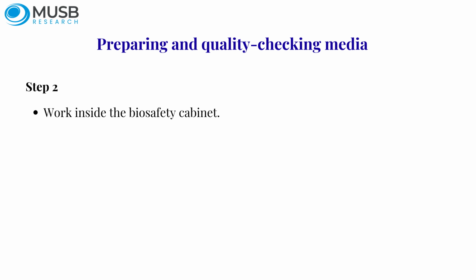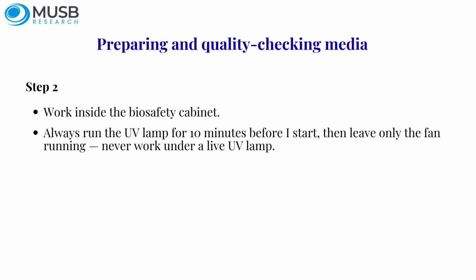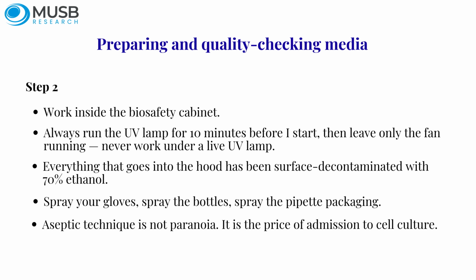Step 2. Work inside the biosafety cabinet. Always run the UV lamp for 10 minutes before I start, then leave only the fan running. Never work under a live UV lamp. Everything that goes into the hood has been surface decontaminated with 70% ethanol. Spray your gloves, spray the bottles, spray the pipette packaging. Aseptic technique is not paranoia. It is the price of admission to cell culture.